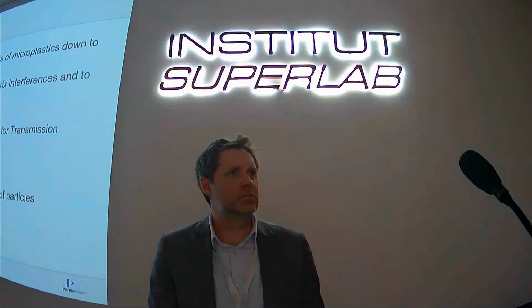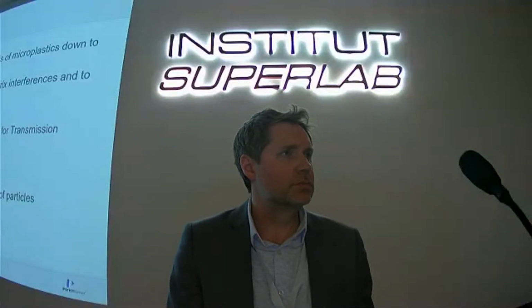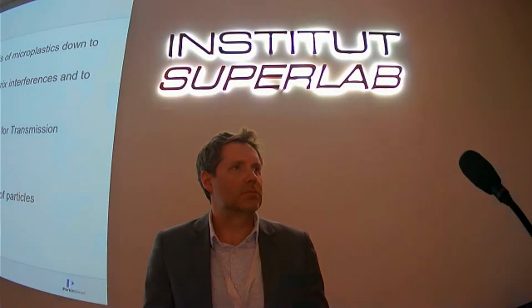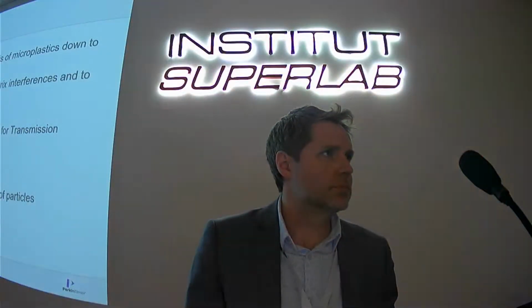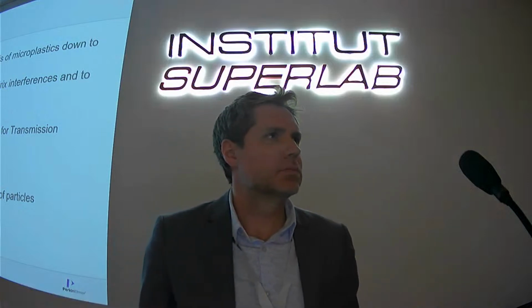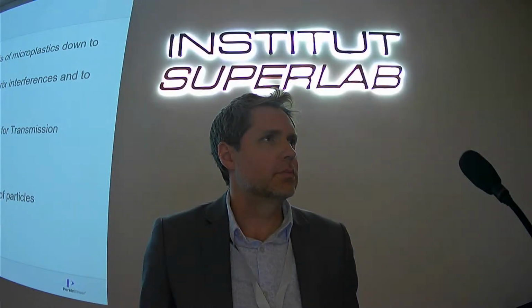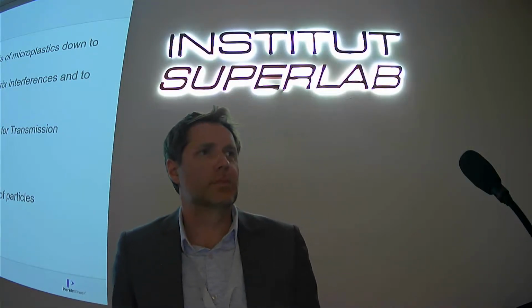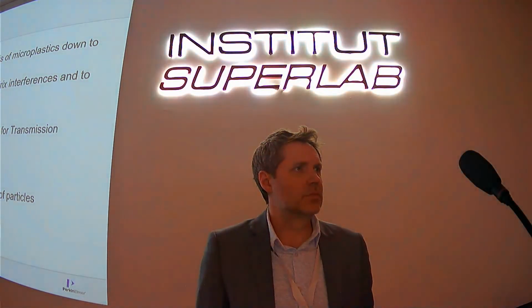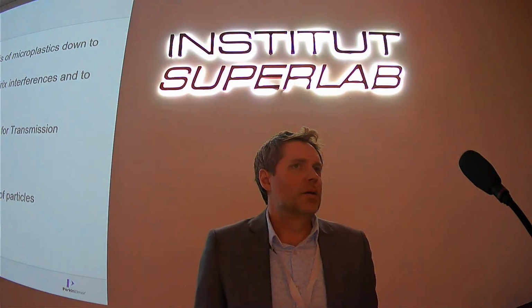Just one question out of curiosity, because we have seen the data from the study on the laboratory study for the microplastics. Did you go into more detail, or have a chance to look into these results and see which FTIR equipment was used? Was it from PerkinElmer or from other vendors? And did you check between different laboratories which are using your equipment, the confidence levels, for example?